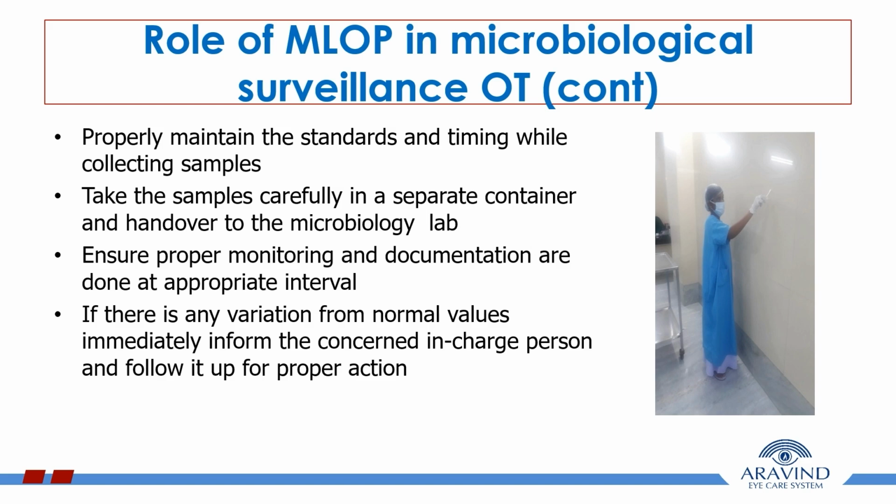Properly maintain the standards and timing while collecting samples. Take the samples carefully in a separate container and hand them over to the microbiology lab. Ensure proper monitoring and documentation are done at appropriate intervals. If there is any variation from normal values, immediately inform the concerned in-charge person and follow up with proper action. Thank you.